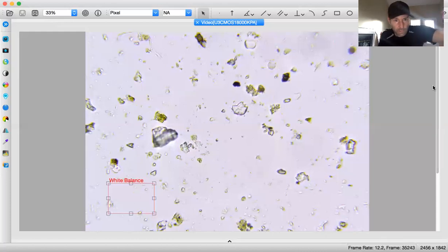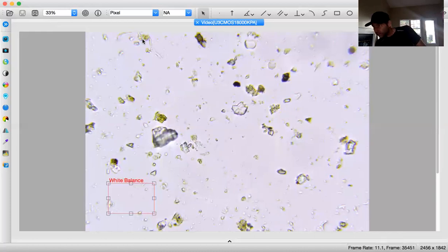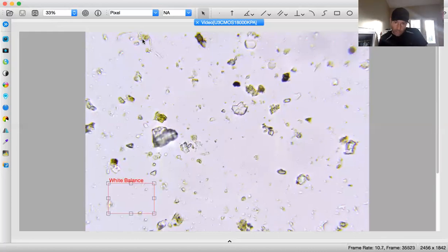This little bit I cannot record, so I have to break it up. So I see 1 on one side and I see about 1 on the other. So I'm just going to say a 0.2. I think that's a fair assessment. And again, this is 5. Yes, 5. So that would be 2. Let's see.